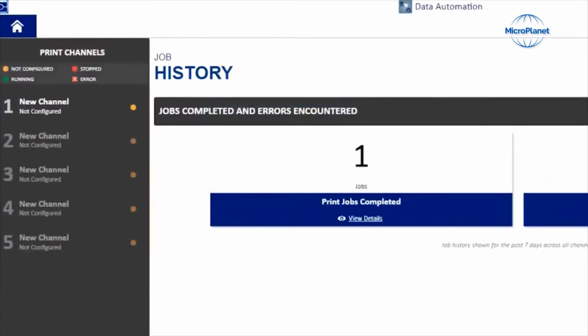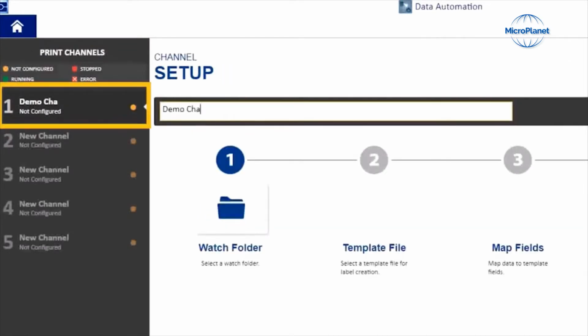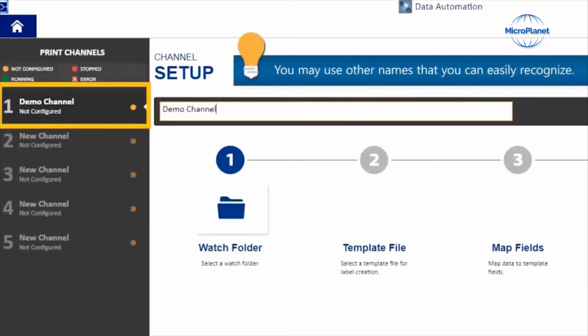We do this by clicking on New Channel and changing its name. For example, let's use Demo Channel. You may use other names that you can easily recognize.